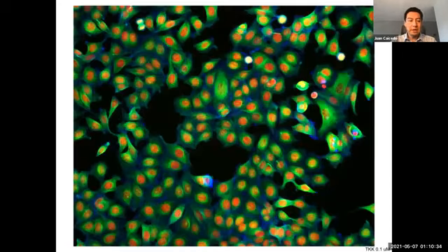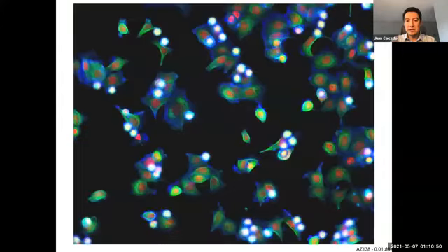And in the previous case, we looked at one specific feature that you can use for determining cells that are sick versus healthy. But in the more general case, if we want to compare one population of cells like this one against another population of cells such as this one, there is no obvious feature that we can point at.